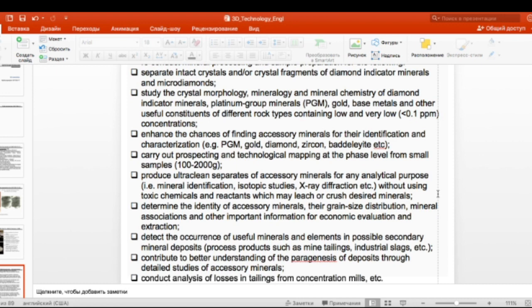Whenever we have, well, basically, we always have new phases, new mineral phases in any sample when using the EPD and HS approach, simply because it's a single grain approach, because you're working with single grains always.